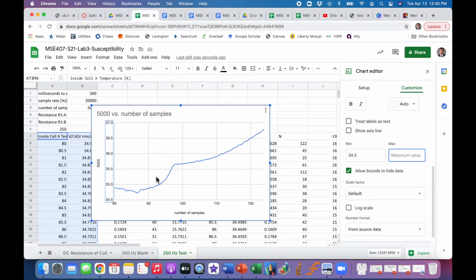So there looks like there's something here, a change in slope. I apologize for that. In the region between 90 and 100, right? But otherwise it has the same kind of similar, you see that there's a slight decrease here, and then it kind of has the kind of parabola-like shape up here. So the curve has been changed here.